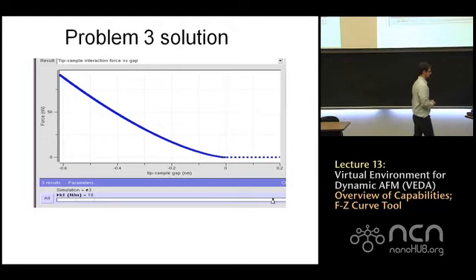You think maybe to do the force distance curve, we want the softest cantilever, so the most sensitive cantilever, but because of these practical limitations, like the Z actuation, we want a cantilever which has a similar stiffness to the sample that we're measuring, actually. So that's how it works out. At the end of the day, you want your cantilever to have a somewhat similar stiffness to the sample, and that's because of the combination of the measurement errors and the limitations on the Z actuation of the piezo. Okay?